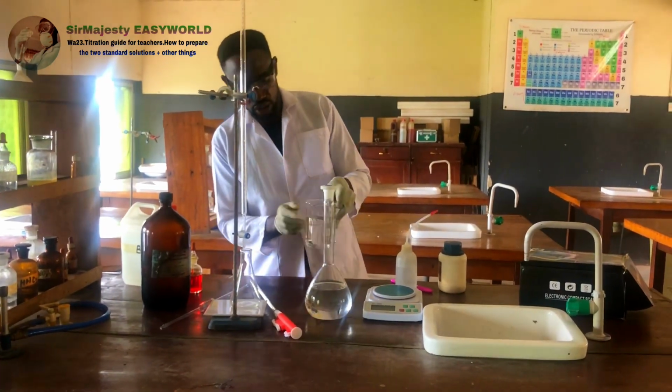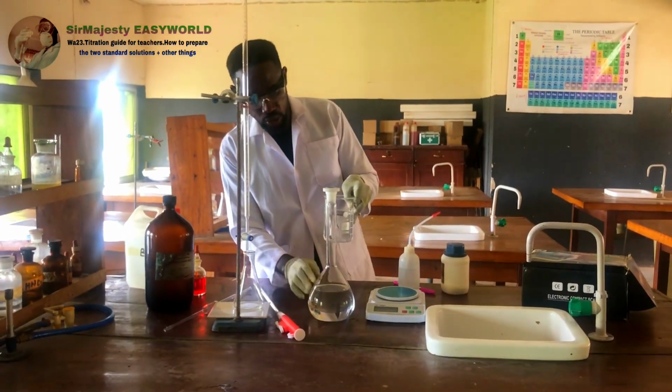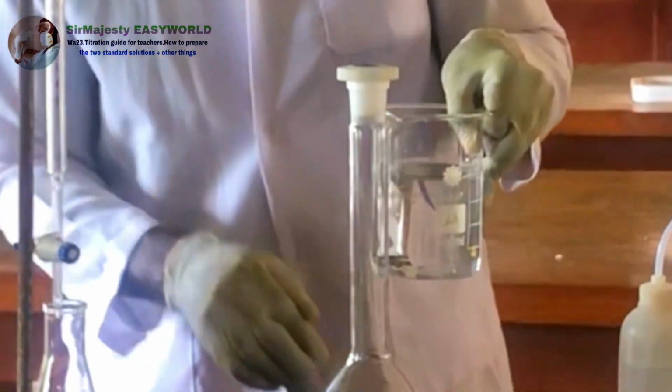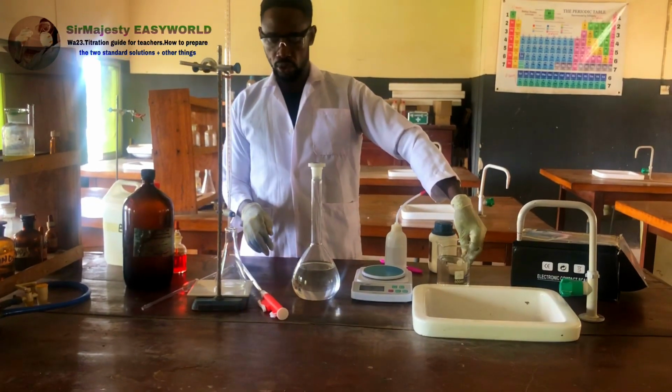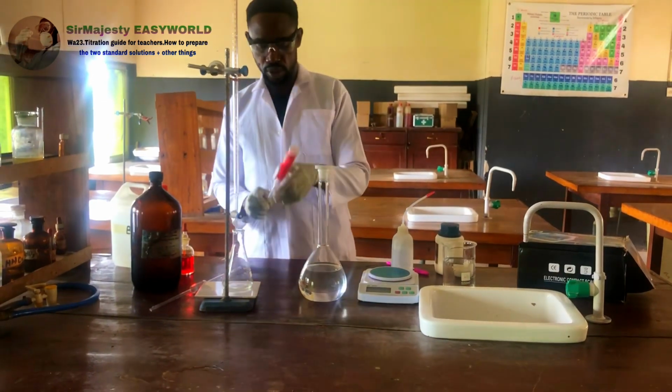What I'm saying is that this is distilled water, and I should not fill all the way to this ring. I might fill it here, then measure my 8.5 and add, shake well, then use water and top up to that mark. That is what you should exactly do. So let me do it for you to see.